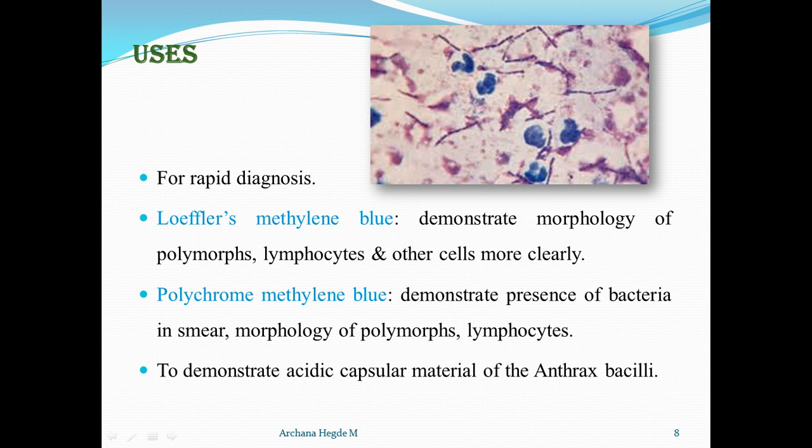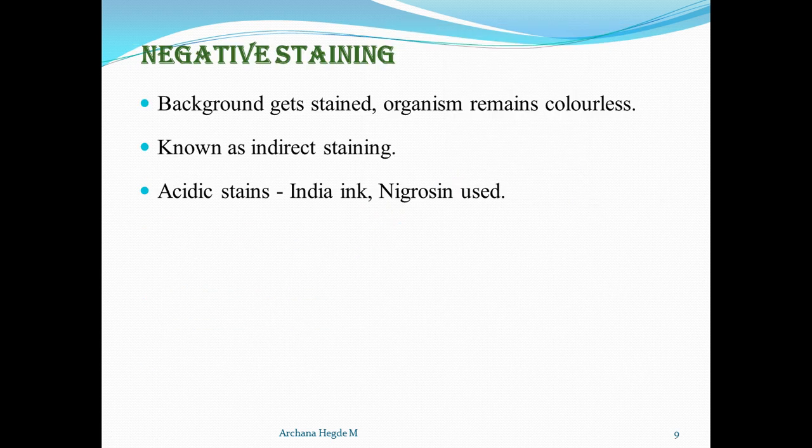Loeffler's methylene blue demonstrates the morphology of polymorphs, lymphocytes and other cells more clearly. Polychrome methylene blue demonstrates the presence of bacteria in a smear and the morphology of polymorphs or lymphocytes. It is also used to demonstrate the acidic capsular material of the anthrax bacilli.